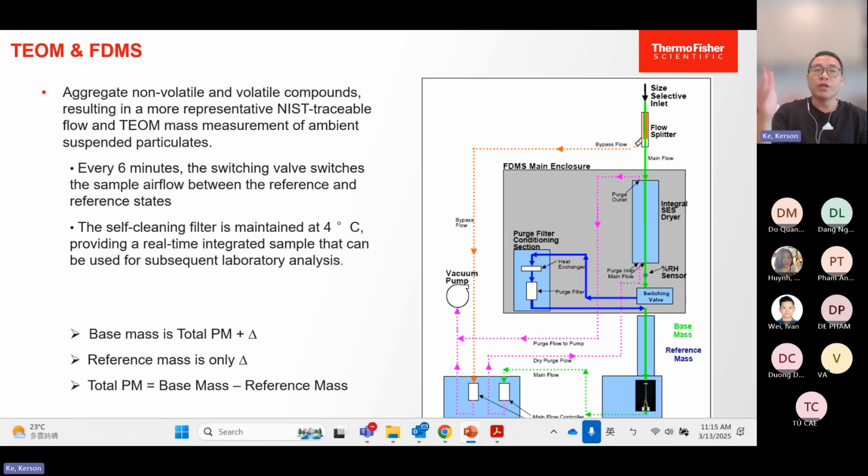But for US EPA, normally they are concerned about the daily average data, because when we compare to FRM, FRM can only provide daily data because the resolution is not enough for hourly, even half day, 12 hours. Understood. Any other questions?